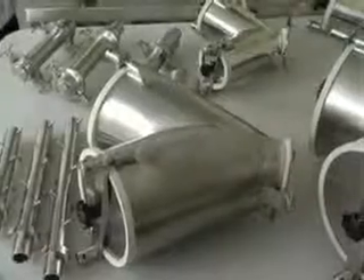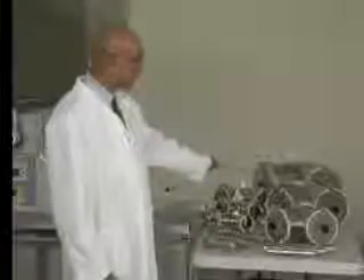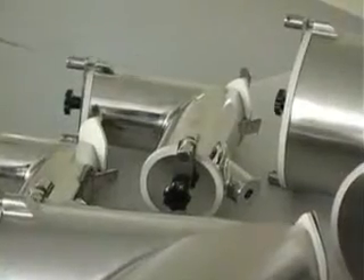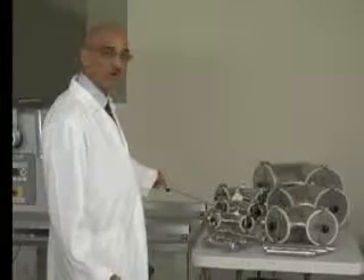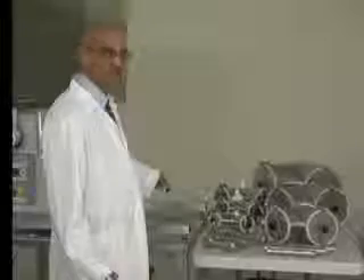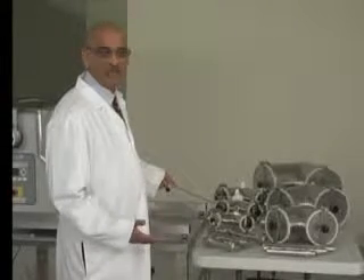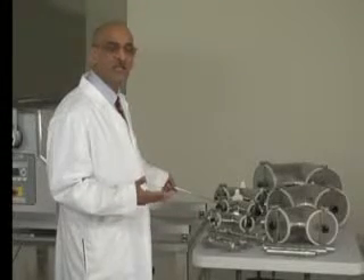These are all the V shells you can use with the Maxi Blend Lab Blender. The 4 quart shell lets you make up to 2 kilograms of blend. The 8 quart shell lets you make up to 4 kilograms. The 16 quart shell lets you make up to 8 kilograms. The 2 quart shell makes about a kilo, the one quart about half a kilo, and the half quart about 250 grams of blend. Of course, it depends on the bulk density of your product — heavier material allows a larger blend, lighter material a smaller one.